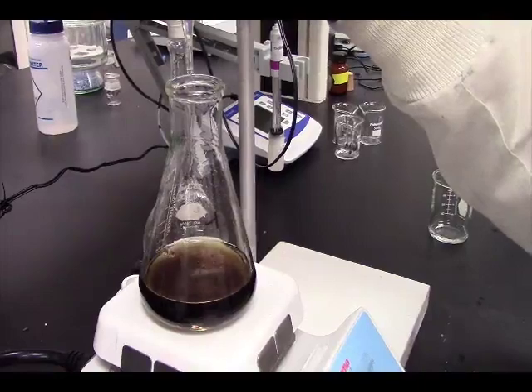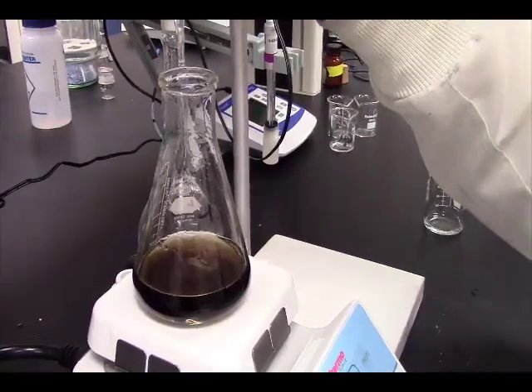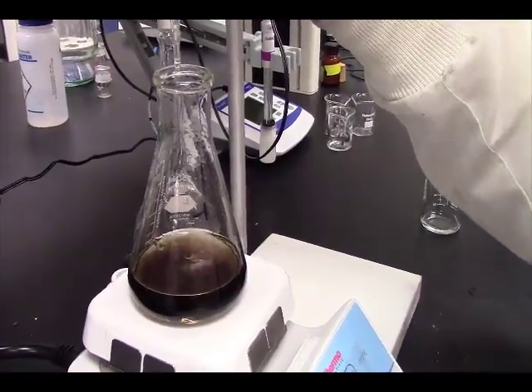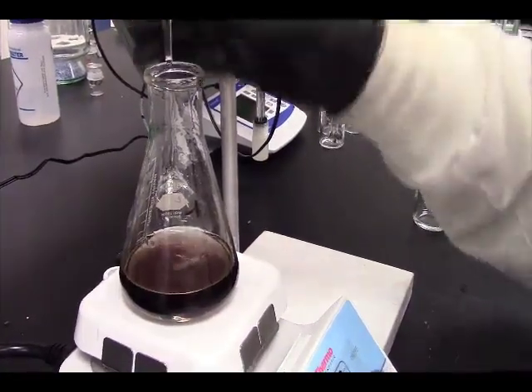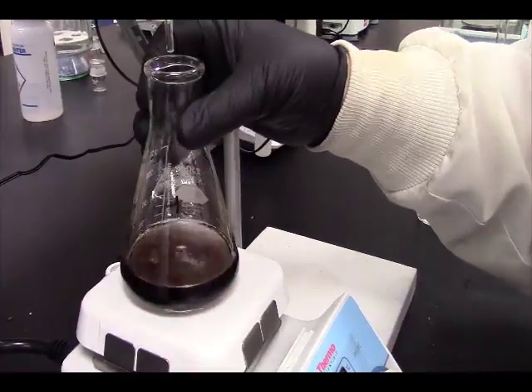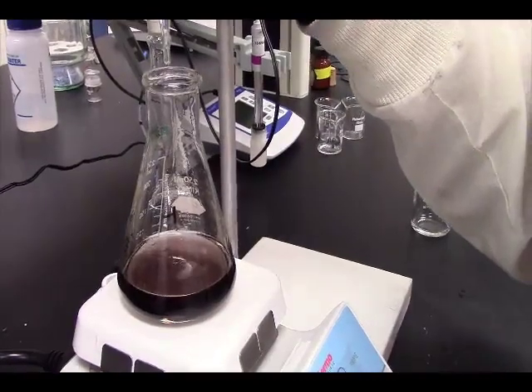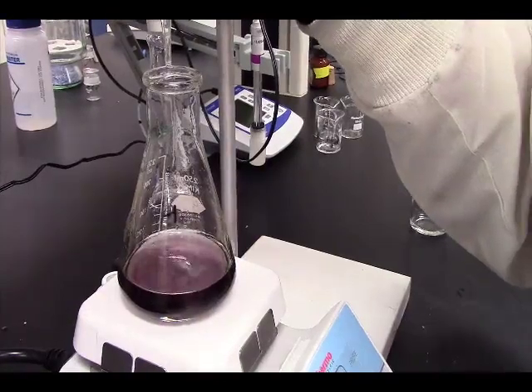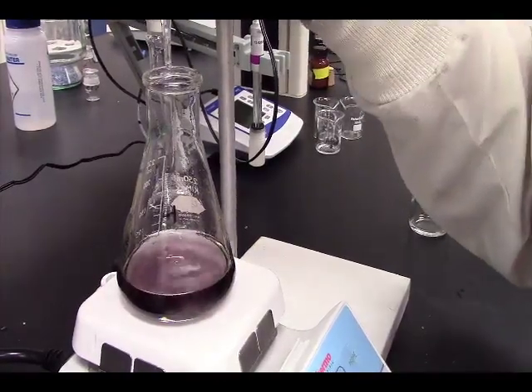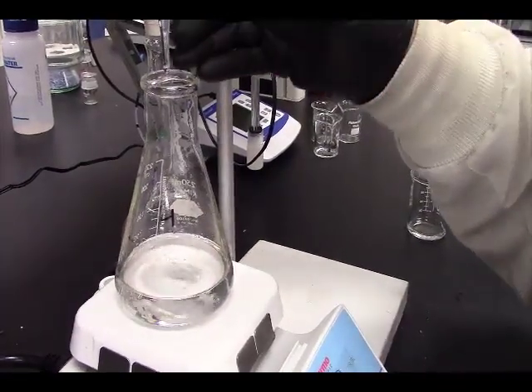I may have had it a little bit too dark still because the color of my iodine mixed with the starch is a little too dark. So my straw color should have been a little lighter. See how it starts trying to go clear? You can definitely tell it's a bluish purple now. Now it's looking like a purple. And now it's clear. And I probably just went over.